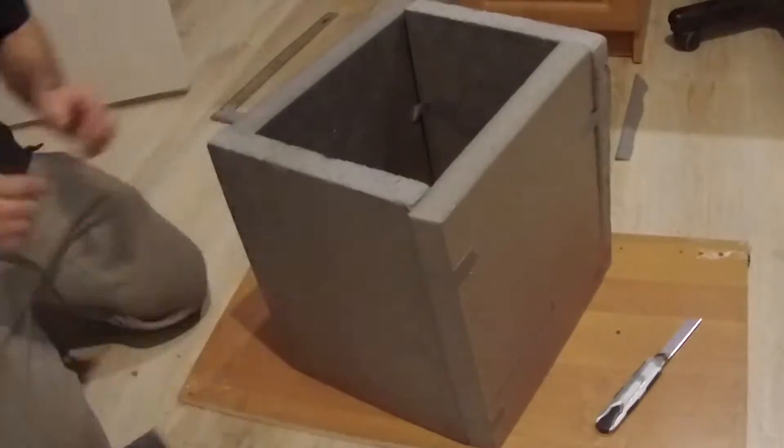You can build such an incubator in order to place liquid mycelium, liquid culture, or a substrate inside. So what do we begin with? First we need to make a box.